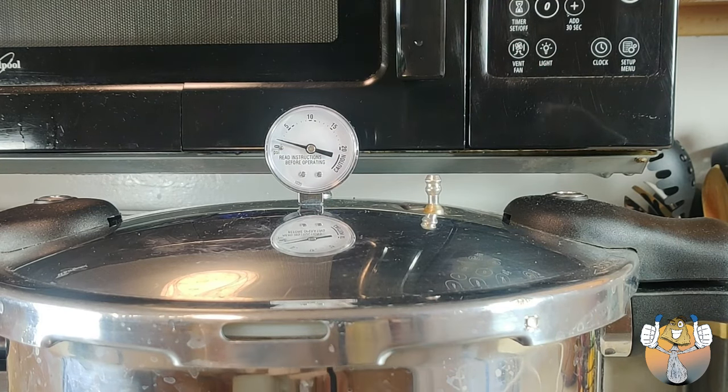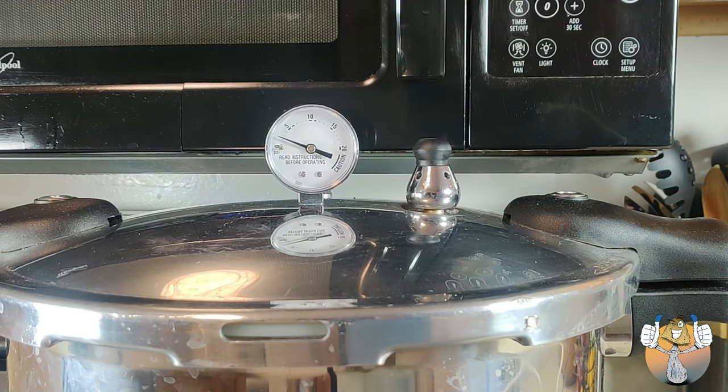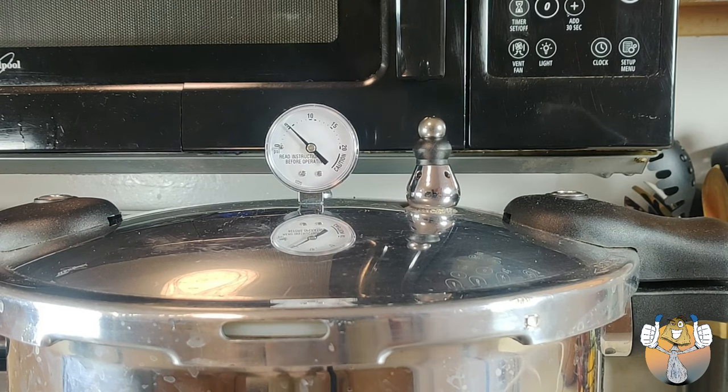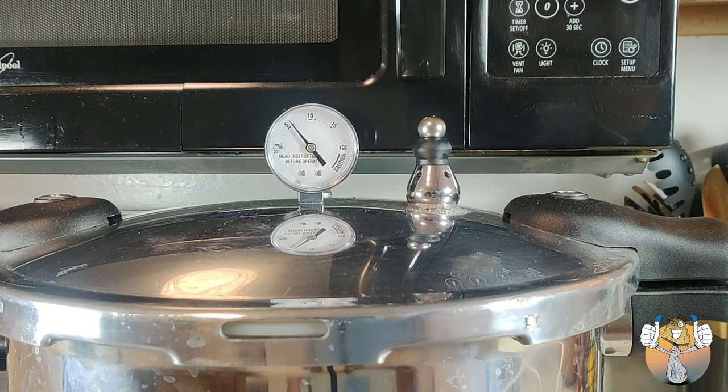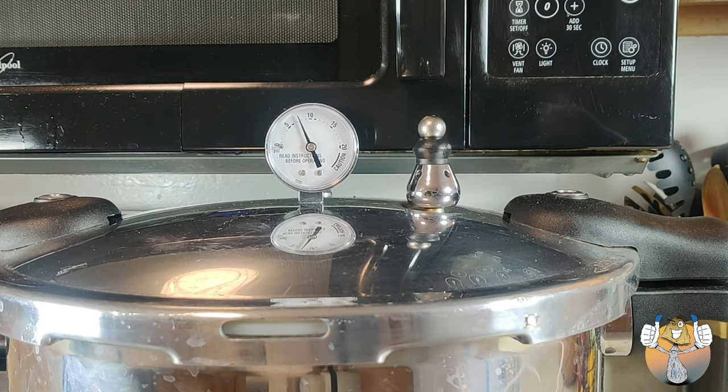All right. So we already built up pressure in our cooker for about 15 minutes. We're going to go ahead and add our weight and build up our pressure now to 15 PSI. And once it reaches the 15 PSI, we will then start our 90-minute timer.